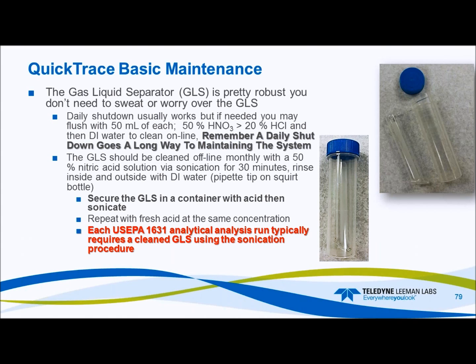And I have to reiterate keeping serialized numbers of your pipettes and different apparatus that you're using during this process. Keep everything in control. Basically, play the 2-year-old and say, mine. It's mine. Nobody else can use it.